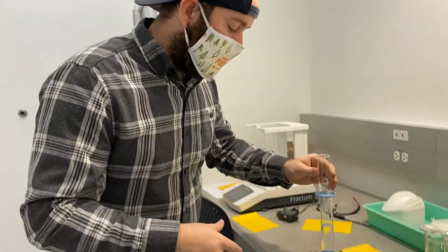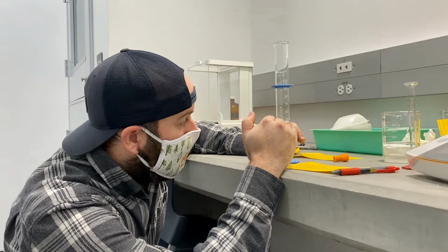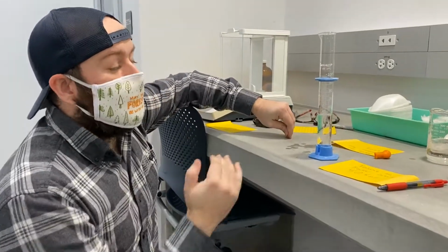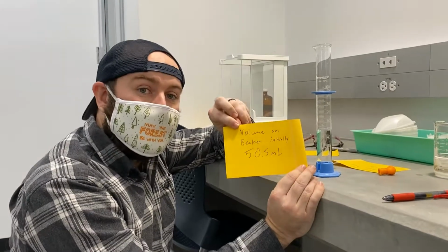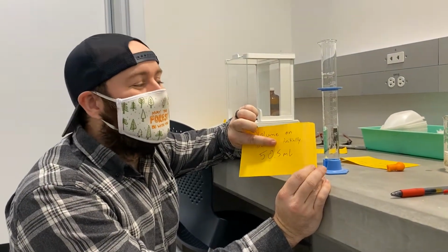So we got to put it on the ground again, or on the level, get our eye level to the graduated cylinder, and then try to see what the volume is. And for me, I'm seeing that this volume is about 50.5 milliliters. So our initial volume on the graduated cylinder is 50.5 milliliters.